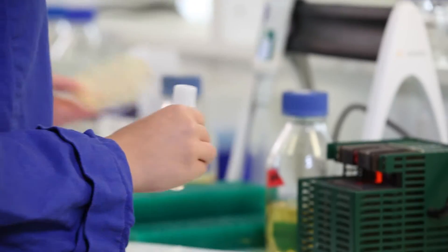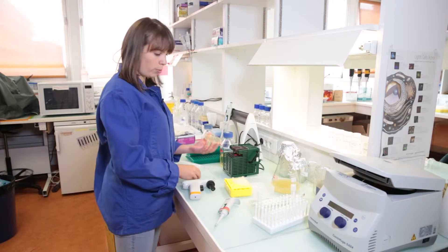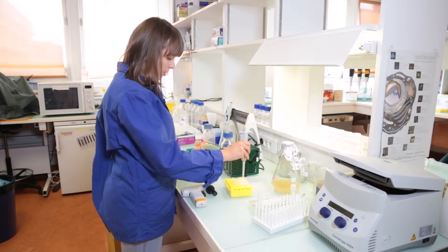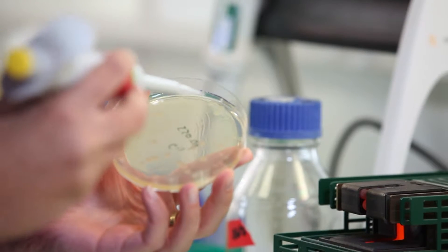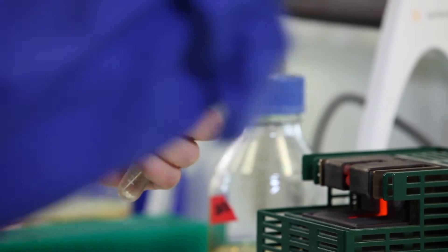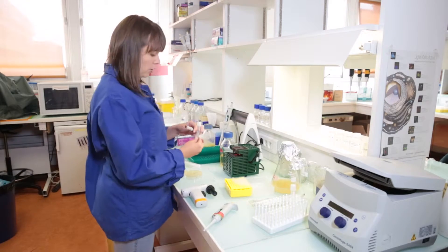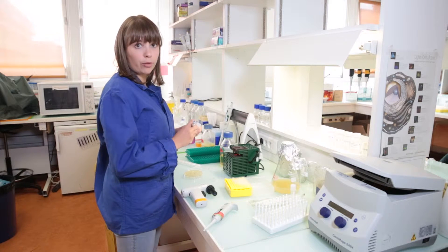And now we have to pick one single colony from a plate. We are also doing this in a sterile environment. So now all we have to do is label our tube and put it to incubate at 37 degrees overnight.